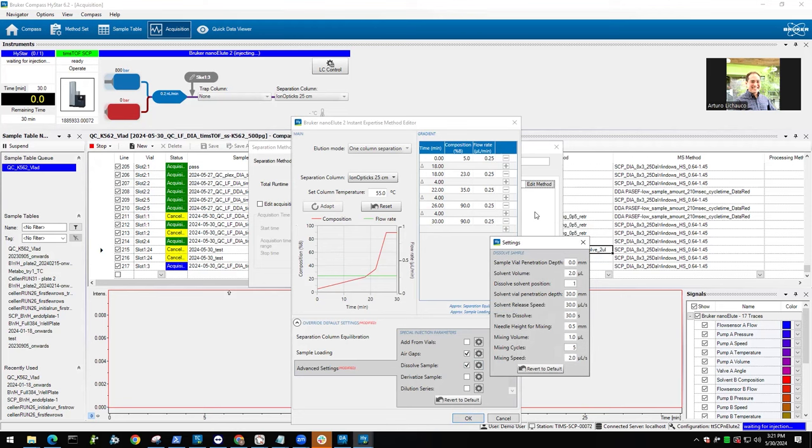One would be the one far in the back. Right. The penetration depth into it. I think when you set this to 0, it would do bottom sense. That's what I did as well here for the well position. So 0 means bottom sensing. Then you go to the actual well. You go to the bottom, retract a little bit. You release your sample with a certain speed. I use 30 microliters per second here. I leave it there for 30 seconds.